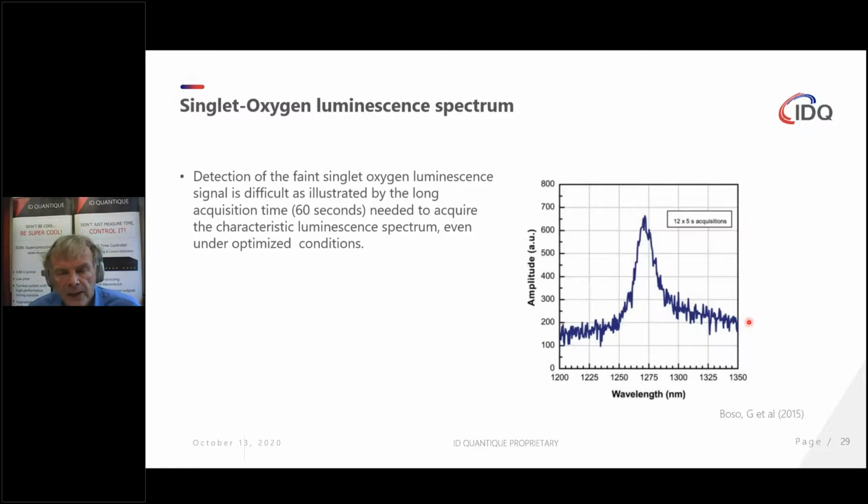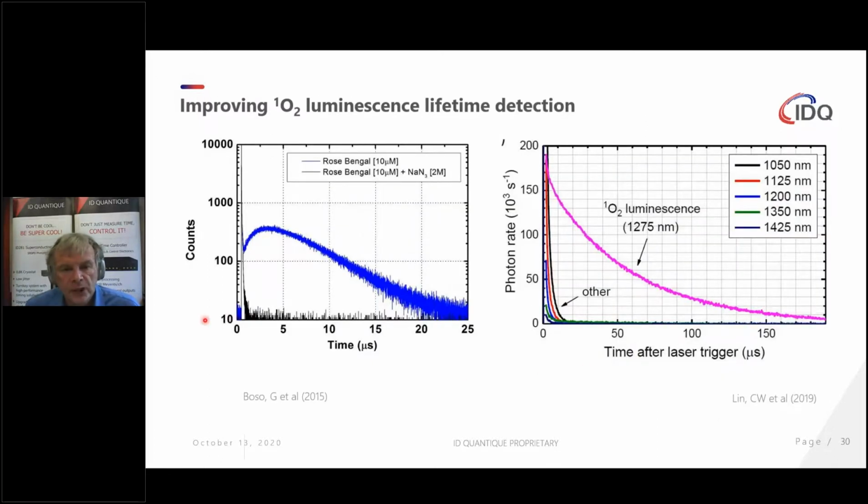If you look at the next slide, it will show you two different ways of measuring it. The first graph on the left-hand side shows it measured with the setup that was depicted. You excite with a simple laser at a fixed repetition rate, and you detect your photons. On the right-hand side is a more advanced method, and you can see a much cleaner measurement of luminescence. It has a very nice single exponential decay. It is done with a new method called synchronized excitation detection. The advantage is that you take advantage of the dead time of your SPAD detector to excite your sample in its dead time.